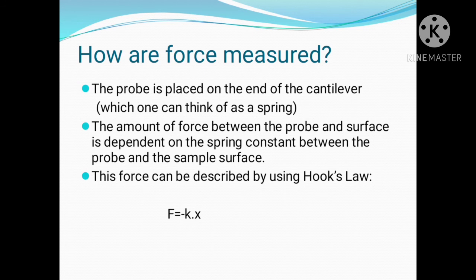The AFM has three main abilities: force measurement, topographic imaging, and manipulation. AFM can be used to measure the forces between the sample and the probe. How are forces measured?